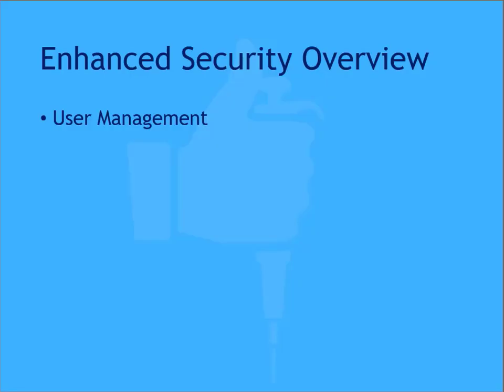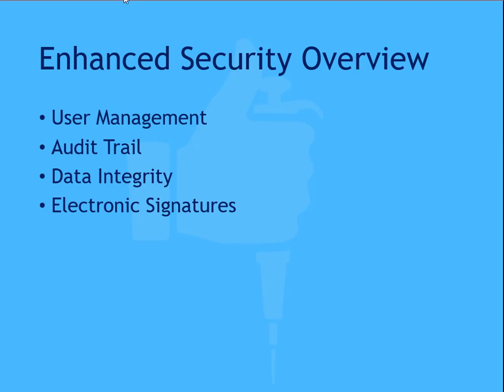This is achieved in various ways: through user management, which offers control over user identification and access; a comprehensive audit trail, which controls and tracks operations performed by users; the confirmation of data integrity, which involves controlling and tracking all data that is imported and exported; electronic signatures allow authorized users to sign and approve files; and controlled reporting, which offers first-class tools for reporting with protected content and support for digital signatures.